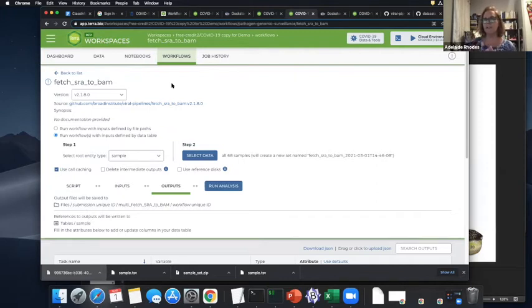number or SRR reference, it's going to pull up a machine and start running this program called eFetch. In my version of the workspace, it doesn't do any of that. It just says this is the location. So it doesn't have to start a machine and go off and spin anything up with Cromwell or do anything. It's just going to say starting point is here.